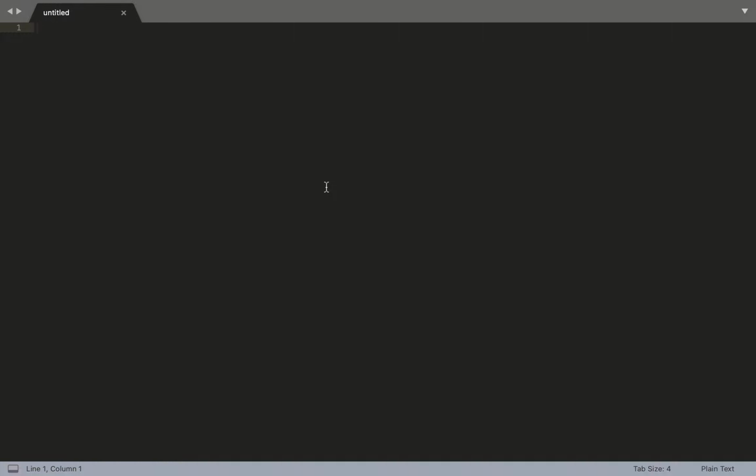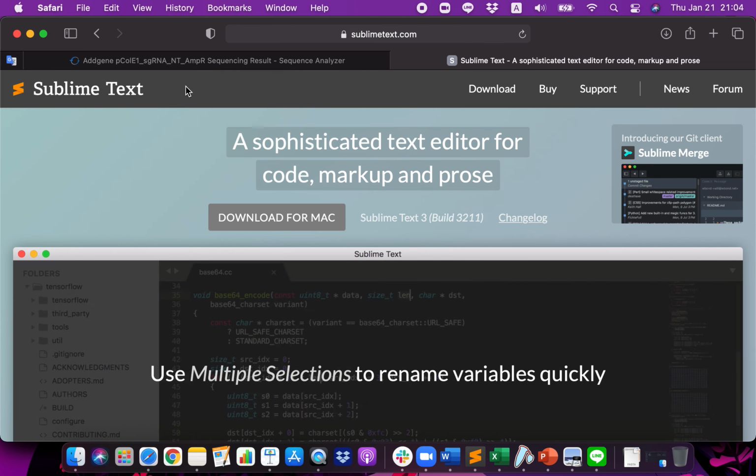So first, in the first line, we're going to start with a greater than symbol and then a short description of the nucleotide sequence. For example, I want to use the ampicillin resistant gene, so I will write down AMPR, or I can also write down the ampicillin resistant gene. Then I will copy the sequence of the ampicillin resistant gene.